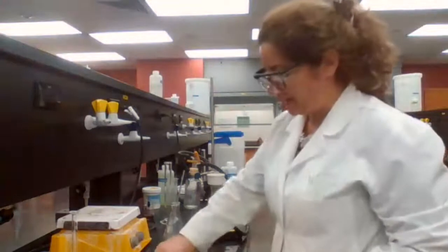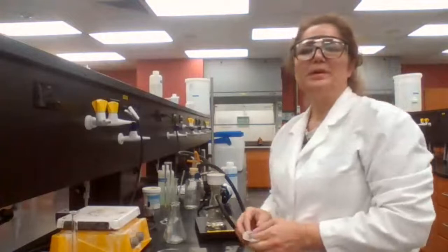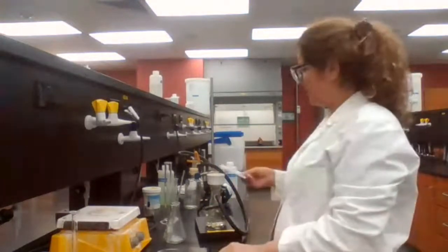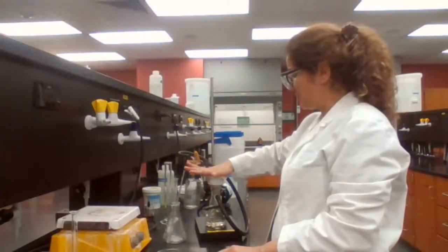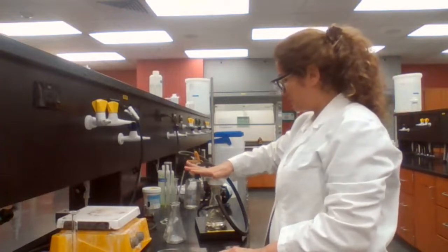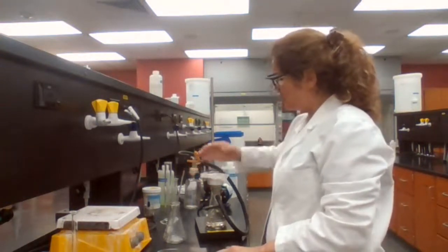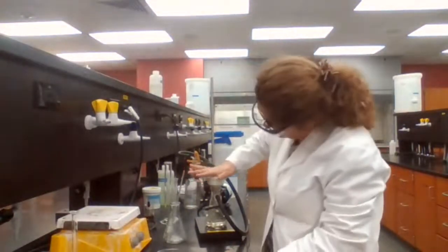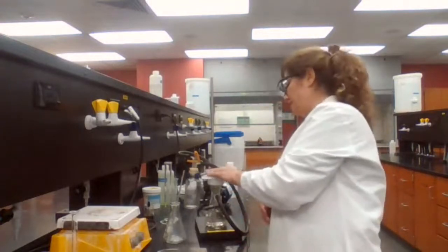Okay, I actually changed my mind. I was going to bring the melt temp here, but since I'm using a laptop, it's more flexible. I can take the laptop to the instrument room and we do the melting point there after it's dry. The vacuum is not very strong, but it's okay.